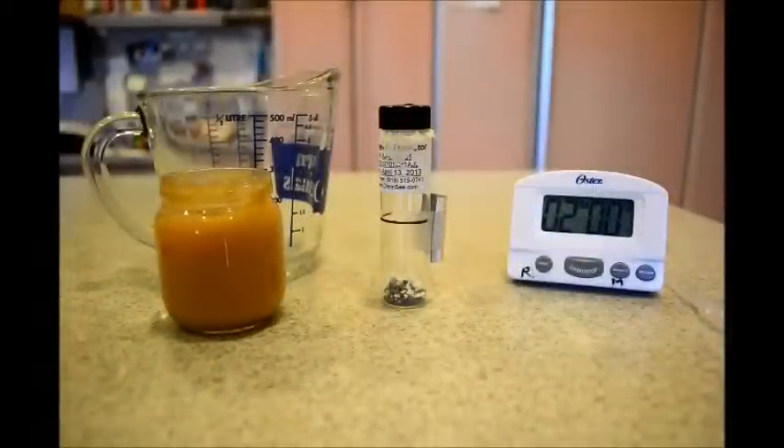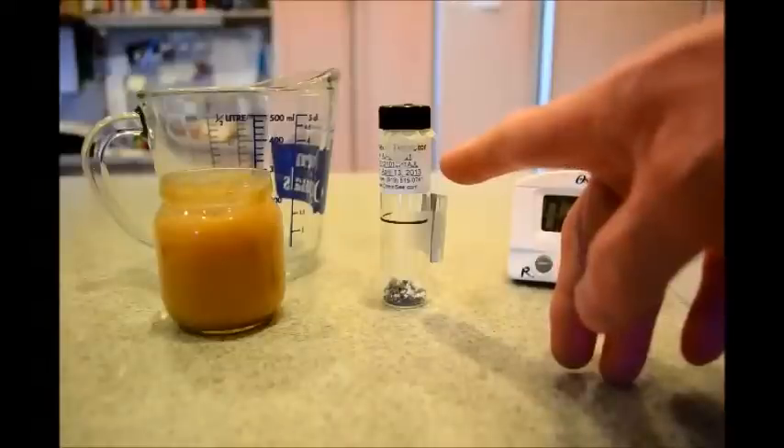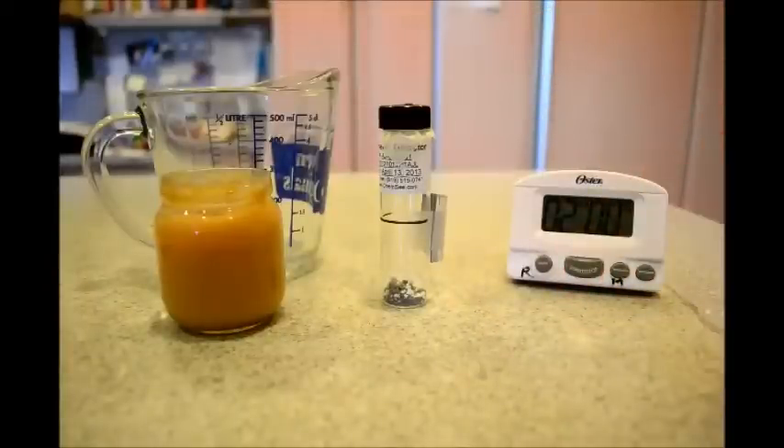Let's check if there's arsenic in baby food. We're going to use the TestSafe arsenic detector. Here's some baby food, and you'll need a timer. First, let's prepare the detector for use.